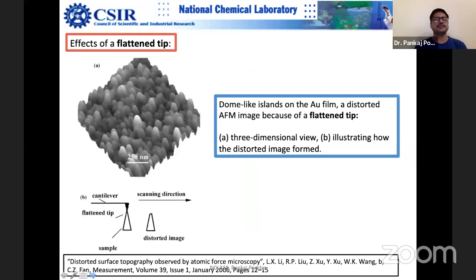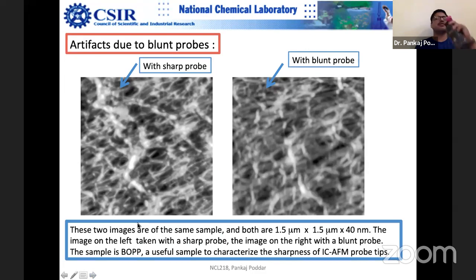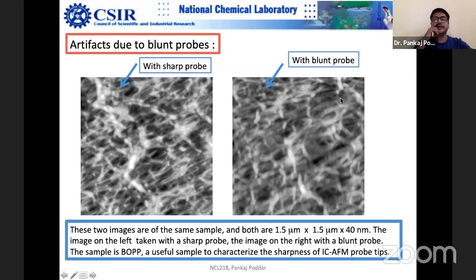Another example: if you have a latent contamination on the tip, the scan direction causes this kind of distorted image — these are all artifacts. Two images of the same sample: left side produced by a sharp probe, right side produced by a blunt probe, and you can see the obvious differences. The test pattern shows pits that should be rectangular but look slanted with a blunt probe.